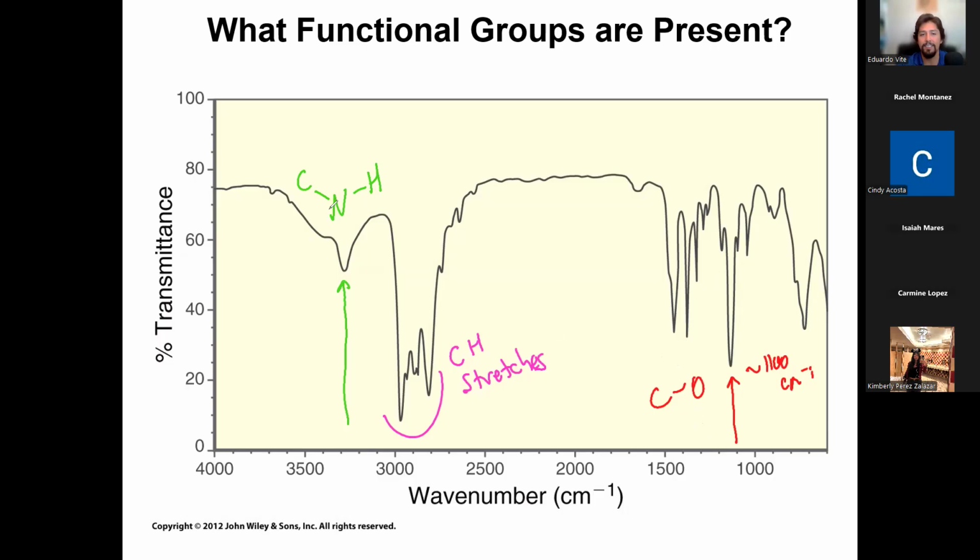In this case, we also have carbon nitrogen. So this could also possibly be the carbon nitrogen peak. We don't know, right? Could also be this one. We don't really know, right? Could even be this one. We don't really know. Good guess.